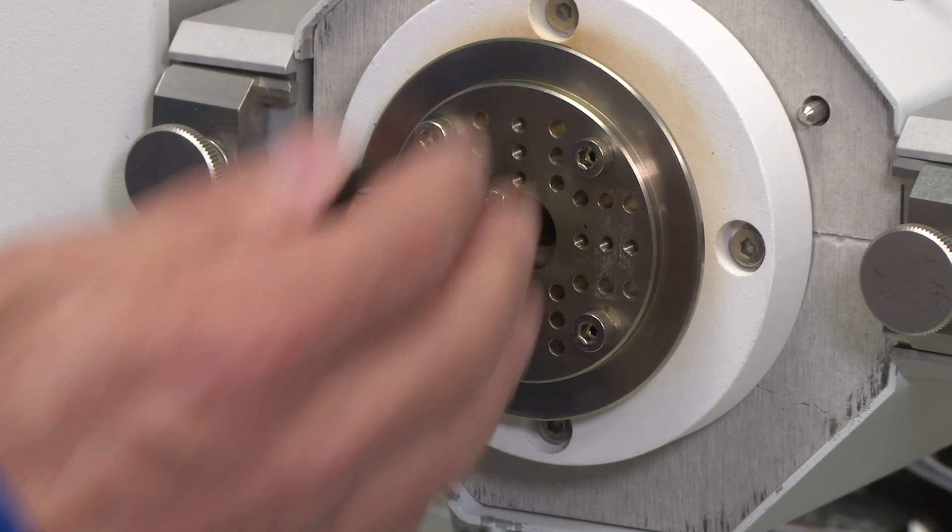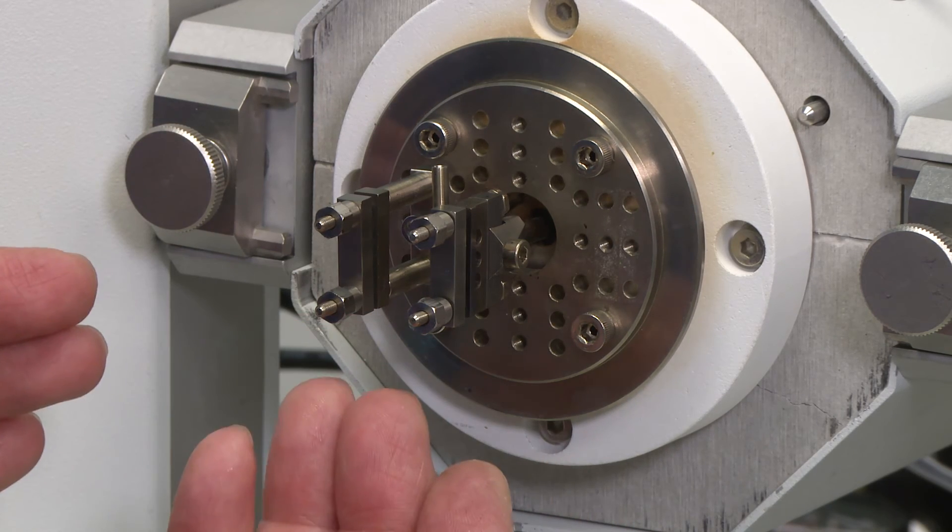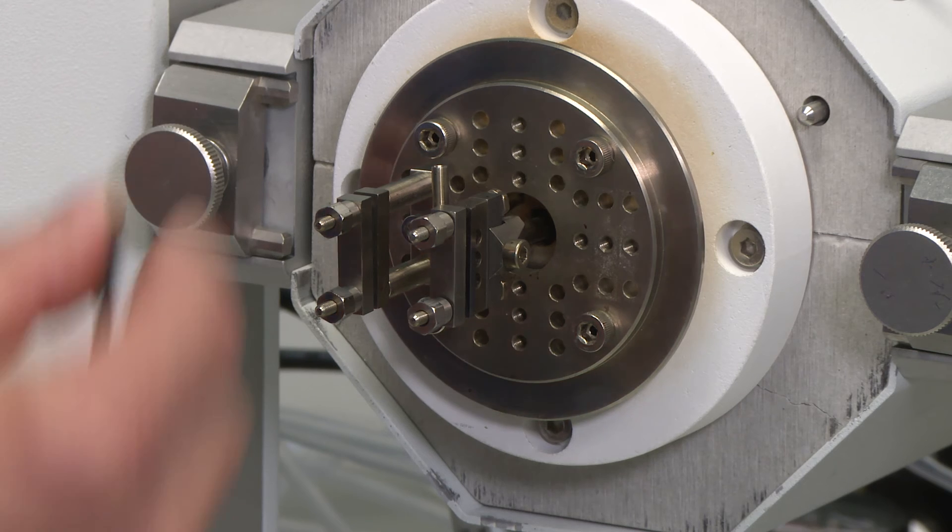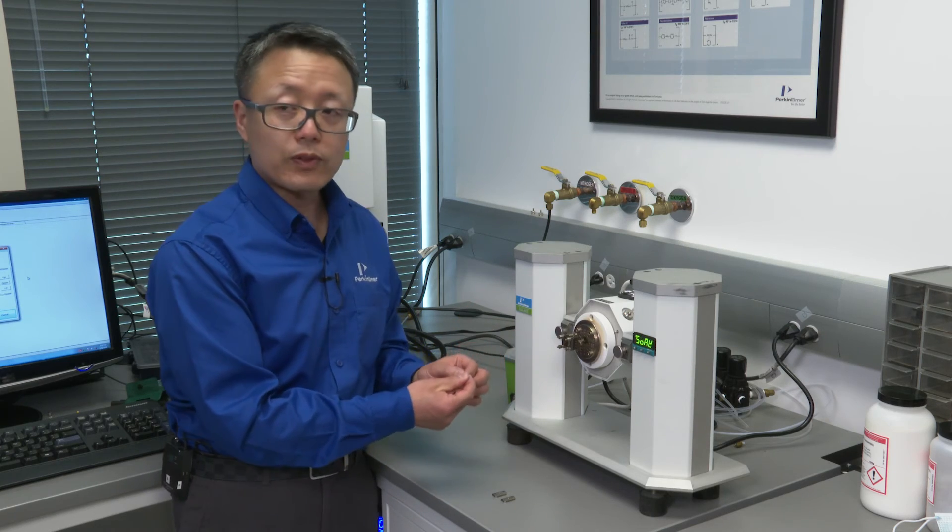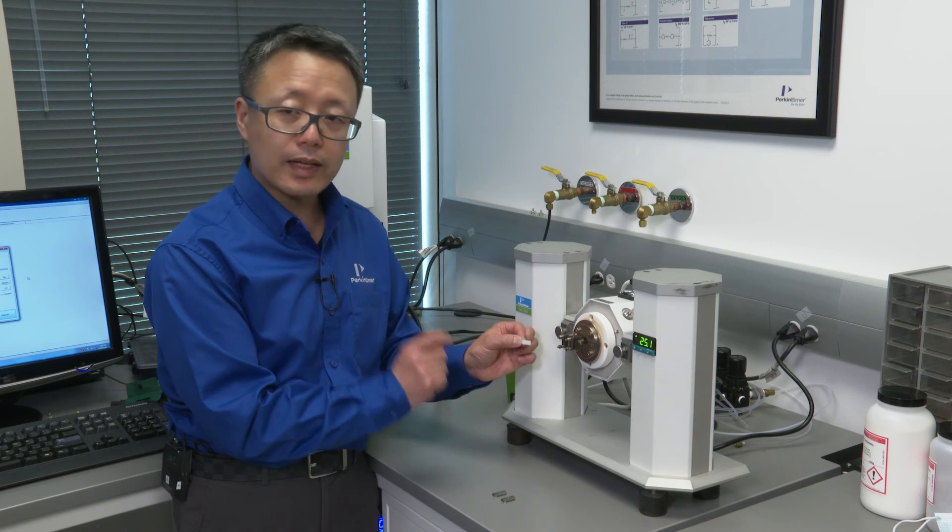The same way we set it up, the T-bar, the rectangular bars, and using the same hex nuts. This setup is usually for shorter samples than dual cantilever bending samples.